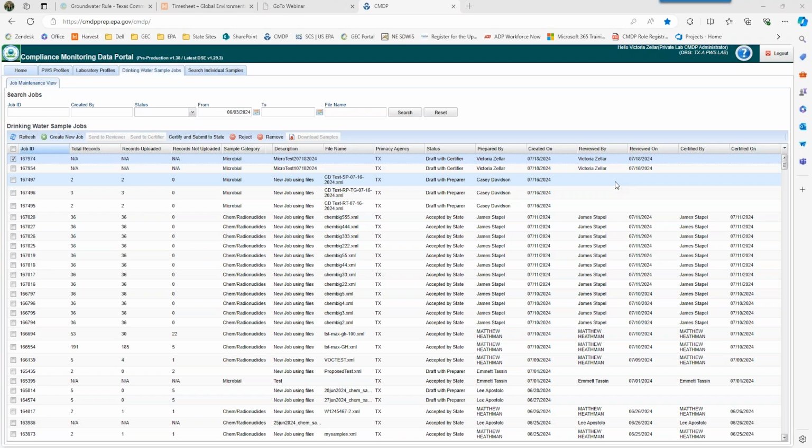Are you saying that we would, okay, I think we answered that one already. So if we understand how to submit, we can start doing that now and no longer submit through E2. I think we would add to that we're going to ask you to practice a few times in test, right, before we let the labs go into production. Yeah, that's correct. All right.